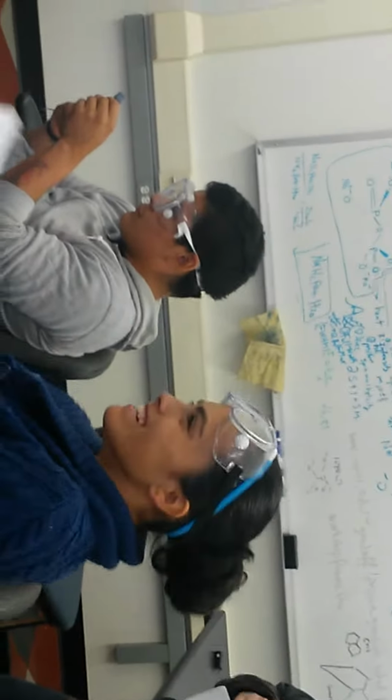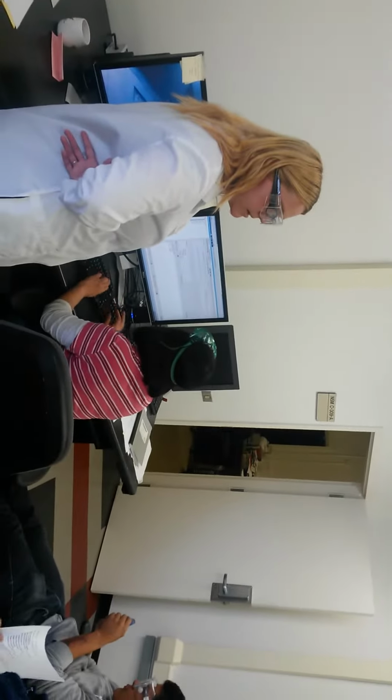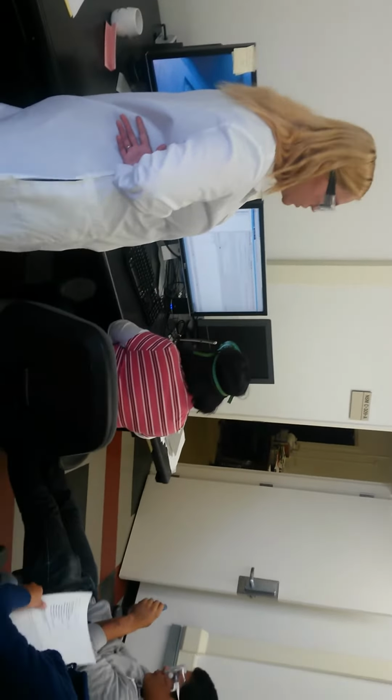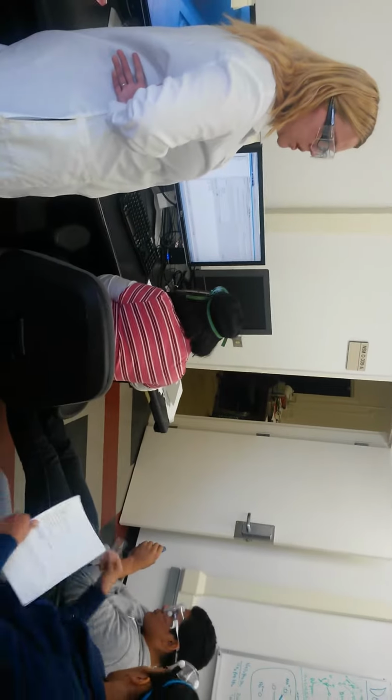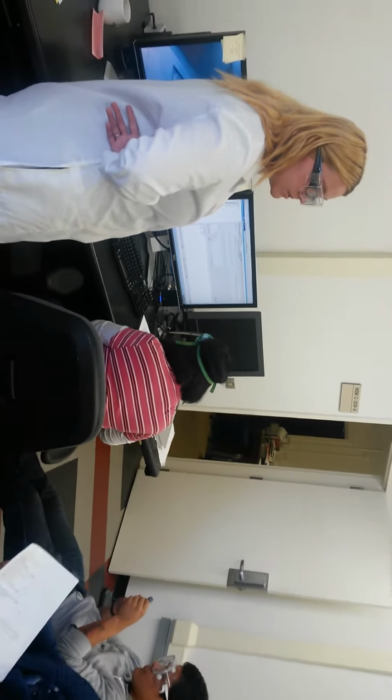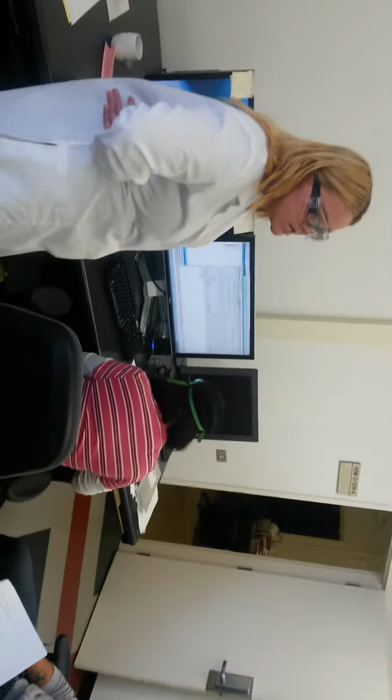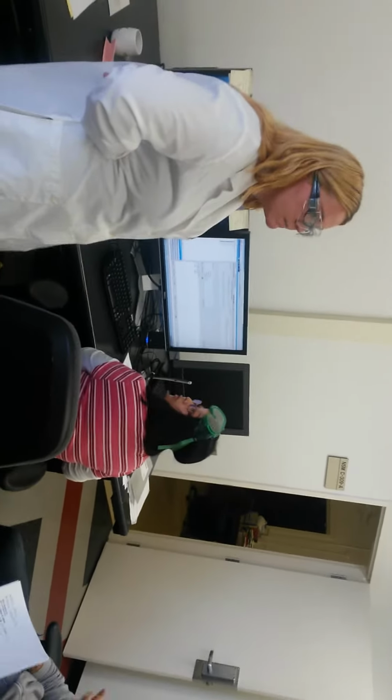In order to get your graphs, can we set up emails to us? To get your HPLC graphs, you can save them to either the desktop or your flash drive as a PDF. I can show you how to do that if you're here long enough. For the Excalibur, the only way I know of to get the MS data is print screen, and then you can take a snapshot of it. Excalibur is specifically for MS, whereas Chromeleon is for HPLC.